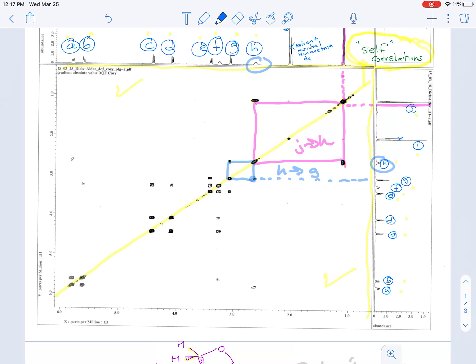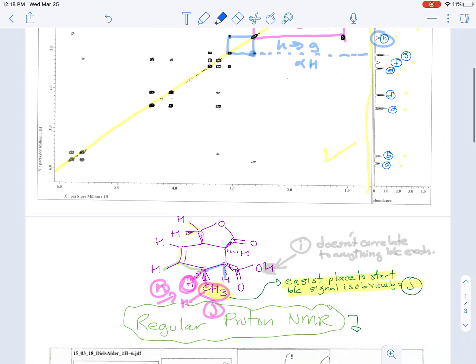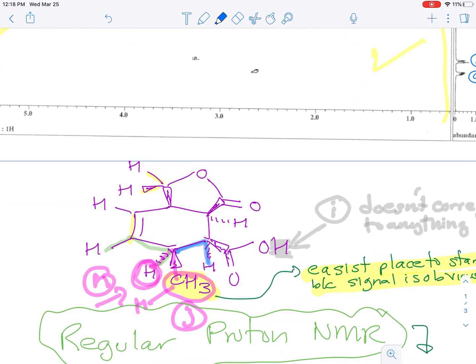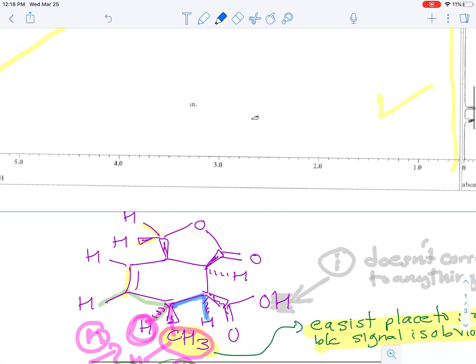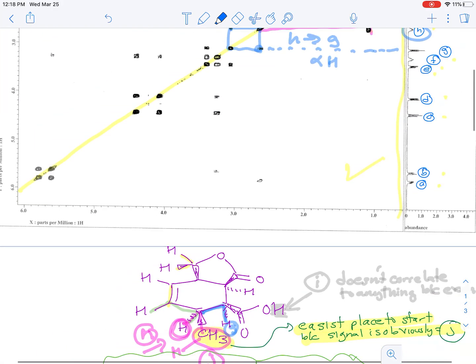And that particular signal has to be the alpha hydrogen to the carbonyl because that's the only thing that makes sense. So that makes this signal G.